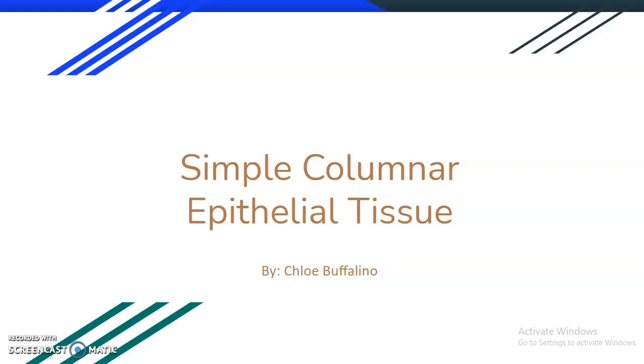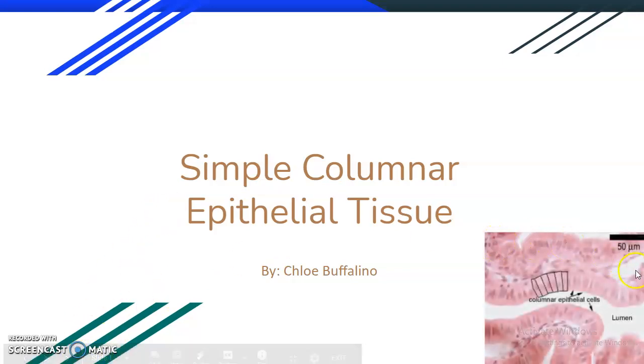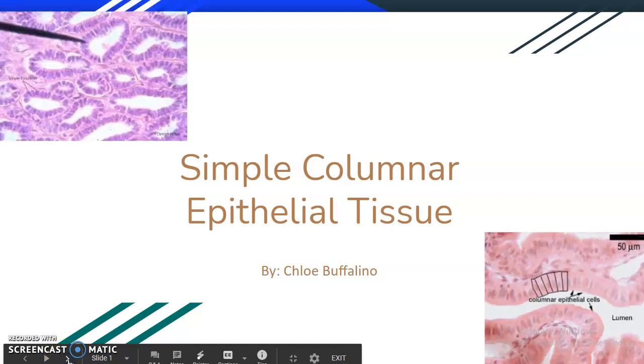So here is my final project for the epithelial tissues, and I have simple columnar. Here's a little diagram underneath the microscope, and it just shows where it is on here. And then here's another photo underneath the microscope, just a different angle.